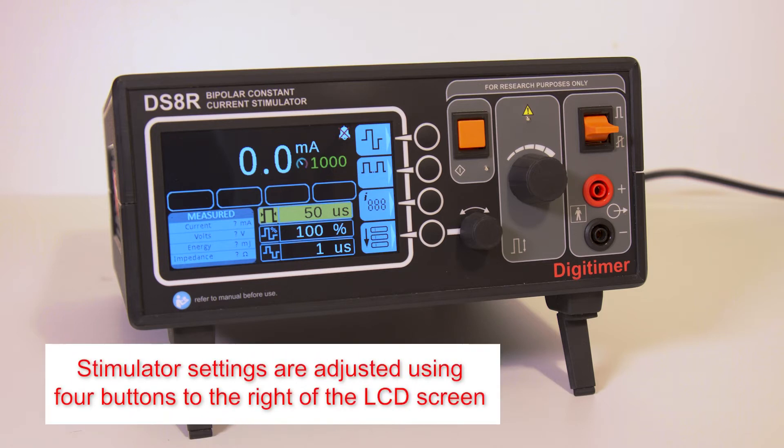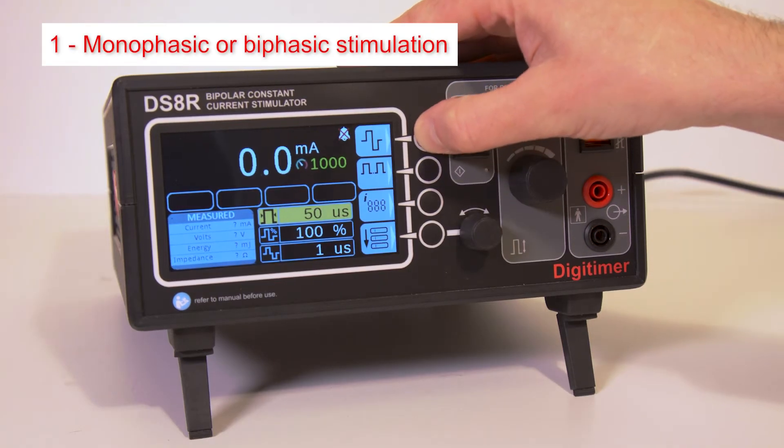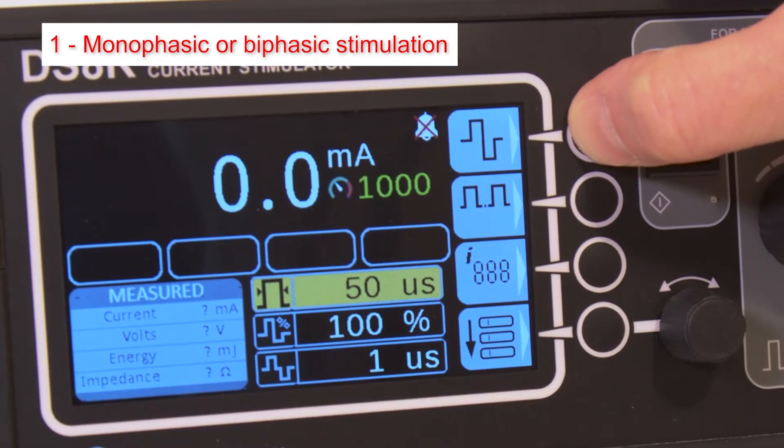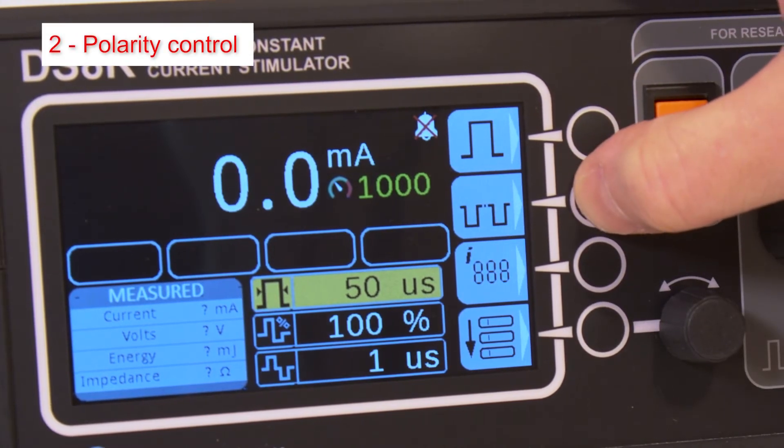The four round buttons to the right of the LCD screen allow the operator to adjust stimulator settings. The top button cycles between monophasic and biphasic stimulation modes. The second button sets the DS8R for normal, reverse, or alternating polarity stimuli.